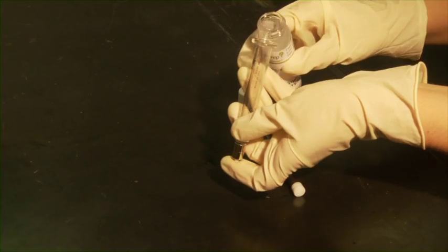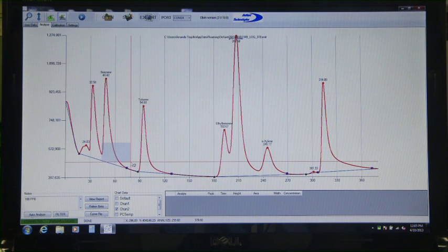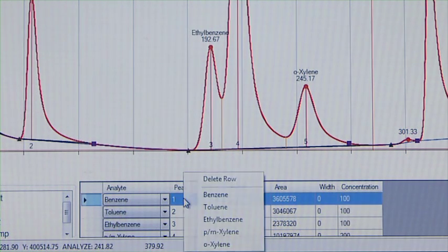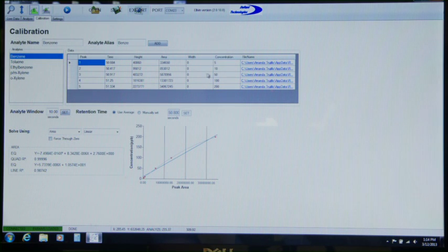Run all five standards from low to high. Integrate the peaks, enter the concentration, and assign analyte names after each run. All the calibration data for each analyte can now be viewed in the calibration window.